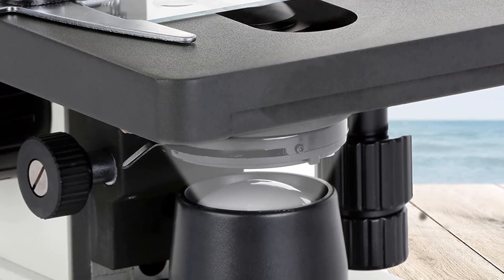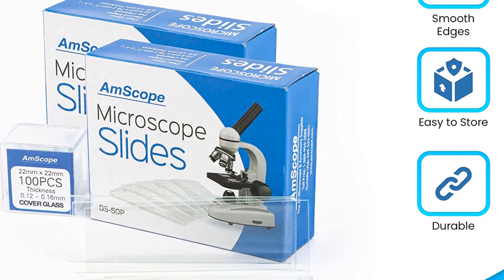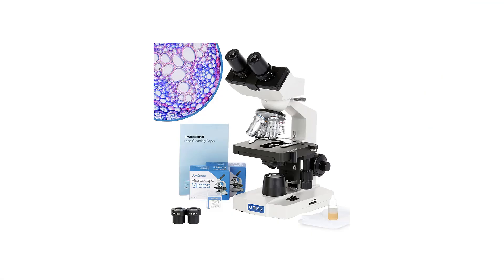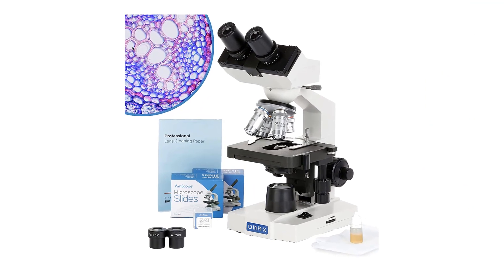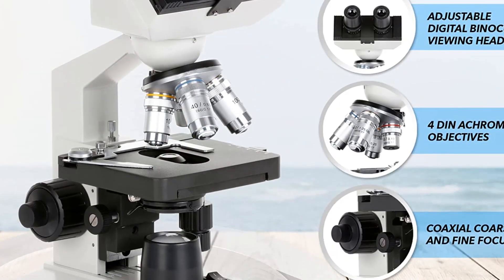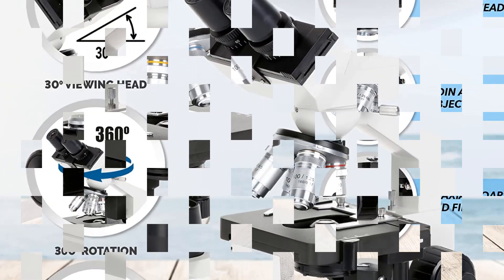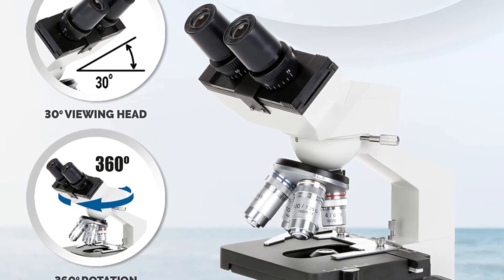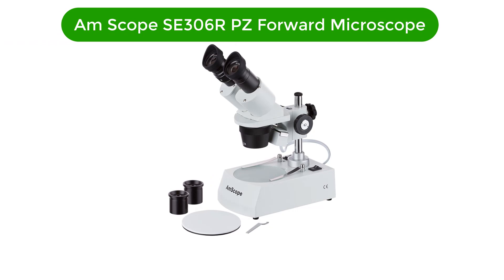Pros: high-powered magnification up to 2000x, LED illumination for clear and sharp images, durable double-layer mechanical stage, includes blank slides, cover slips, and lens cleaning paper, easy to use and suitable for beginners. Cons: not suitable for professional use, and cannot be used to observe live specimens.